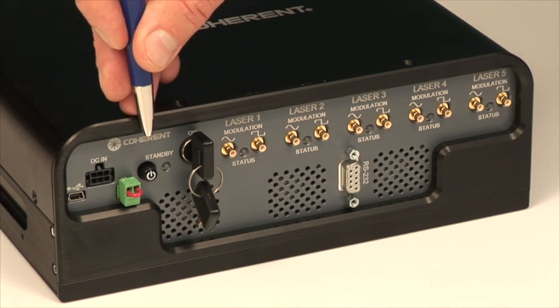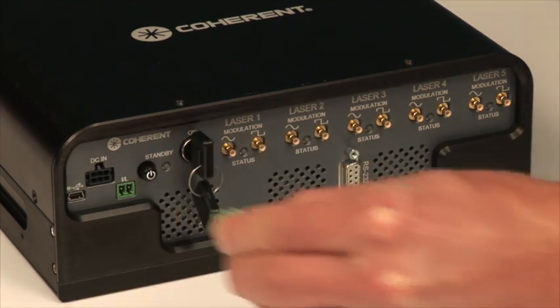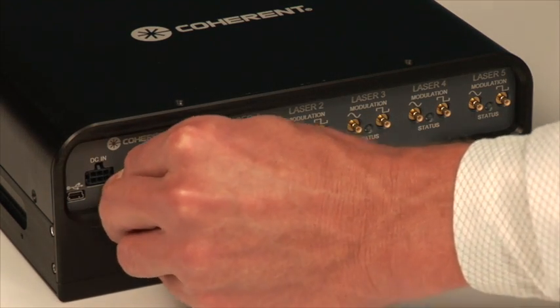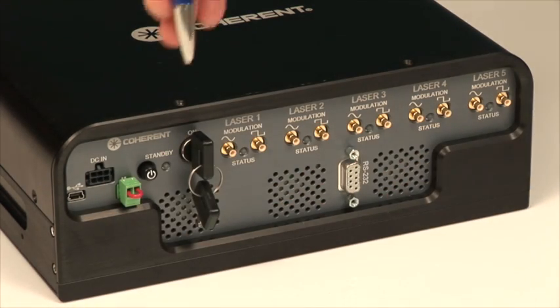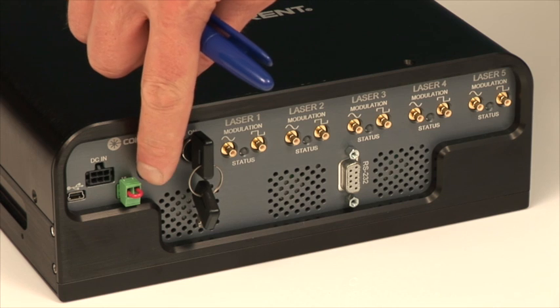Every laser box is included with an interlock connector. This is a laser safety feature and can be opened or closed for laser safety. Each laser box also comes complete with a power on/off switch to turn the laser box on and off.